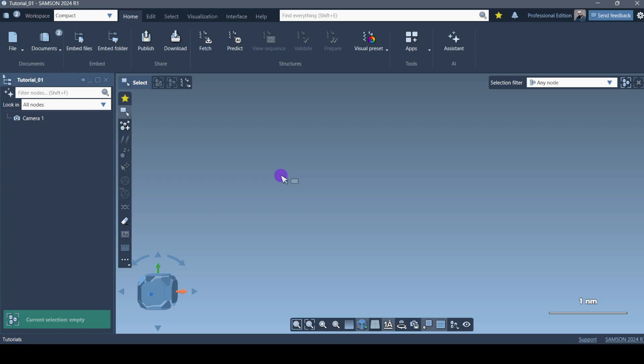It is a self-explanatory kind of experience where you don't need any help and there's no need to watch a video — it's automatically going to come to you. But if you watch my video and follow along, it will be a more fun way to do things because I'll also explain important things. For example, when exploring those things, you can select regions, change visualization, and change how the color looks for a particular region — and you do that in your research all the time.